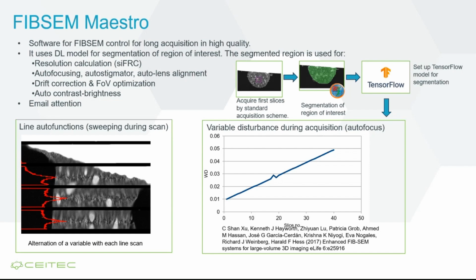And also this cool thing from John's enhanced FIB-SEM system is implemented there. From time to time you overfocus a little bit, underfocus a little bit, and if resolution improves, you tune the focus accordingly.